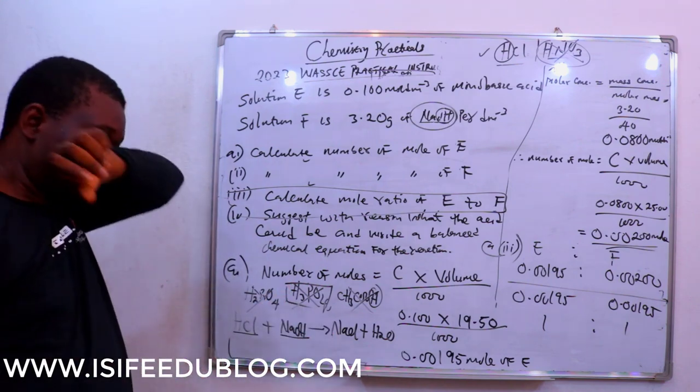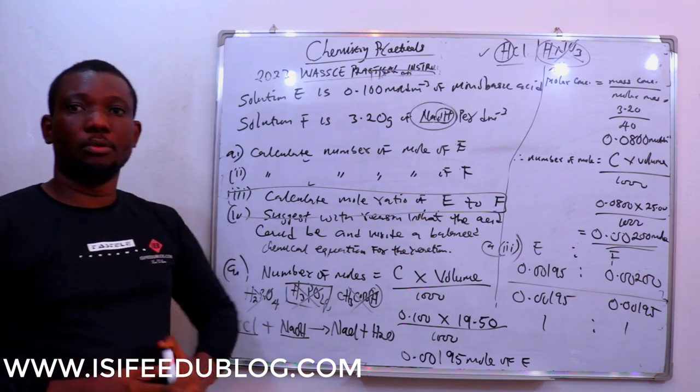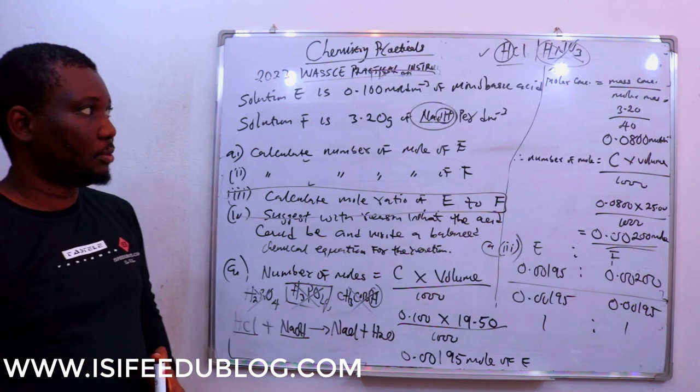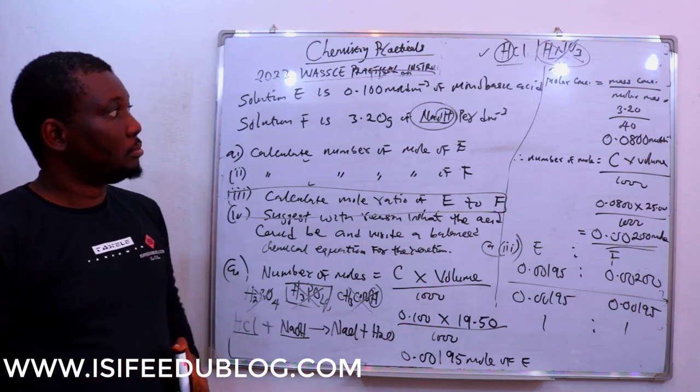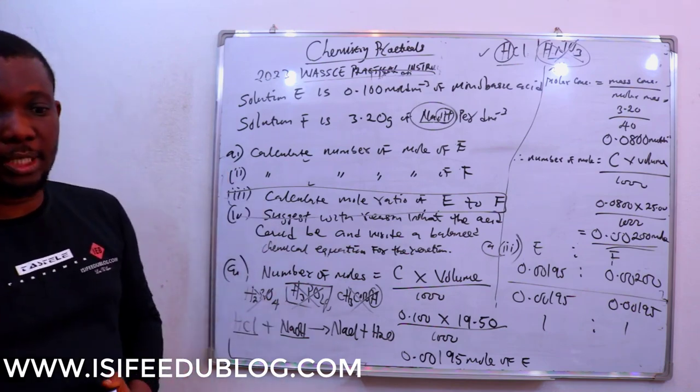Okay, so there's one more thing I would like us to also do in this video. Another possible analysis or interpretation to this number 1 before we now go to salt analysis.